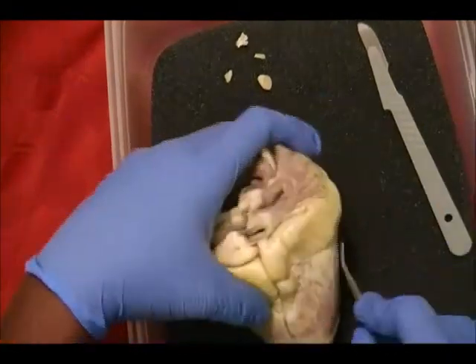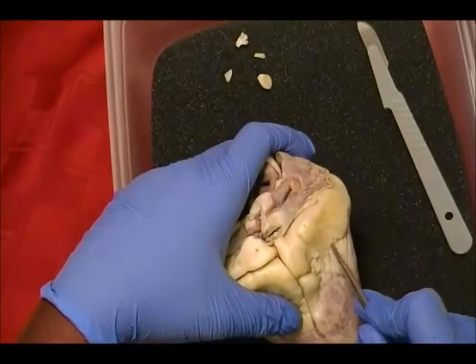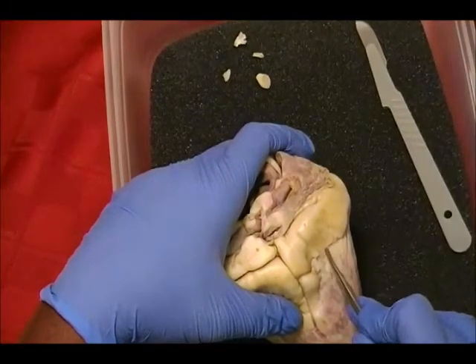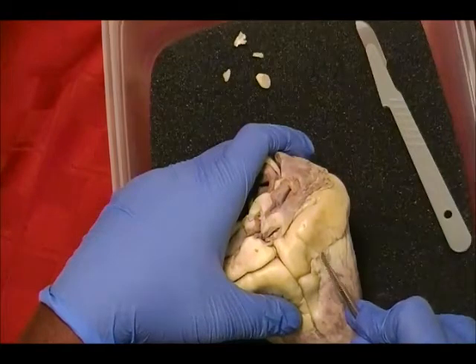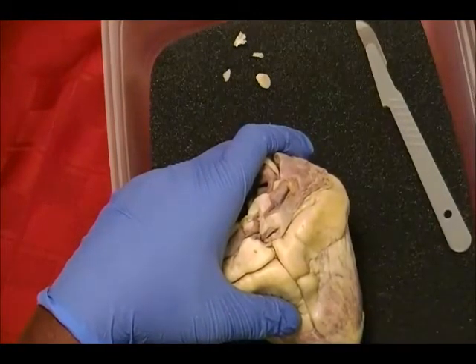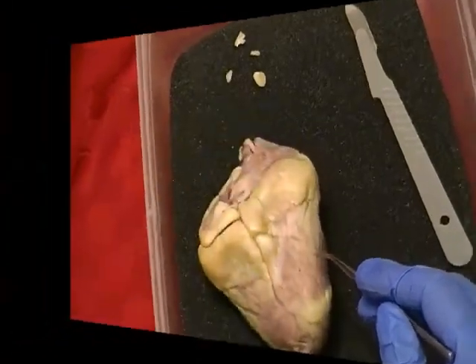The coronary sinus is in this area here. It's a little deeper inside. The coronary sinus is made up of veins, and the blood in these vessels is going to the right atrium, and the blood that's going into the right atrium is deoxygenated.